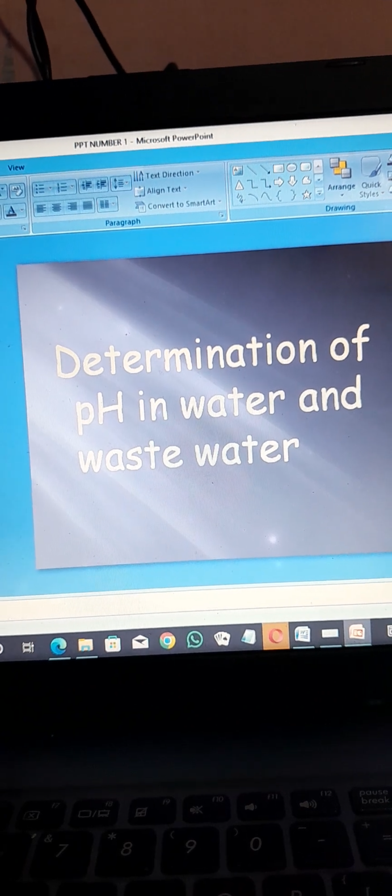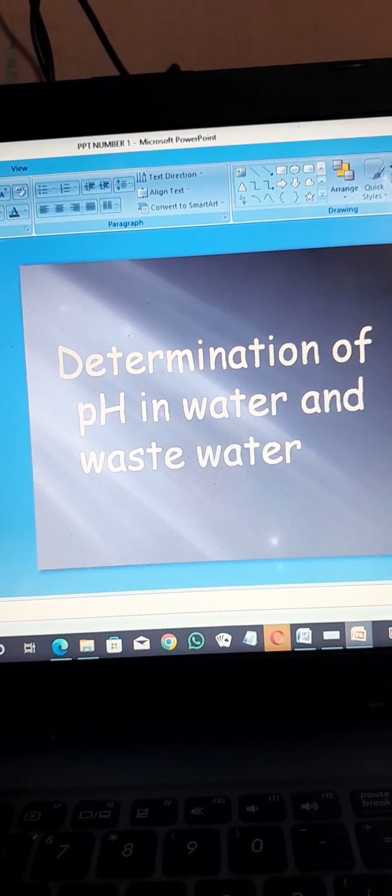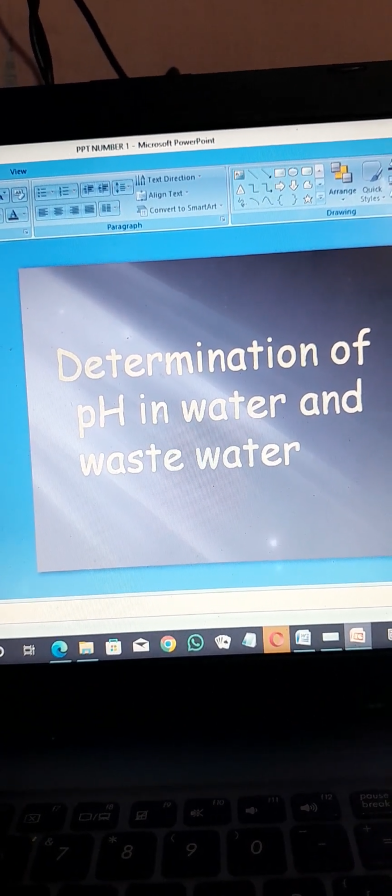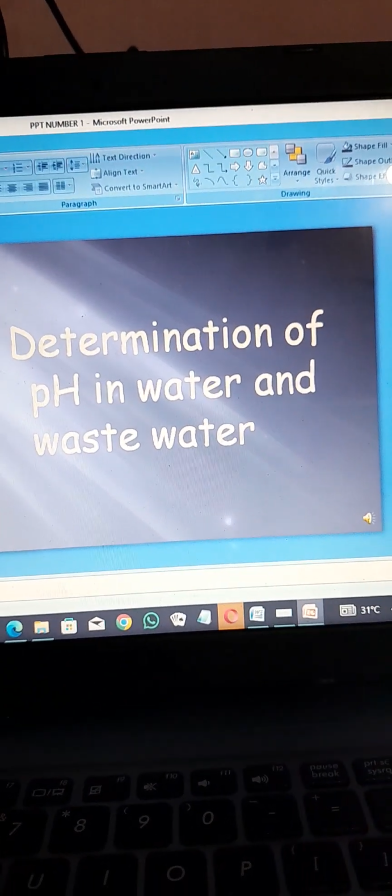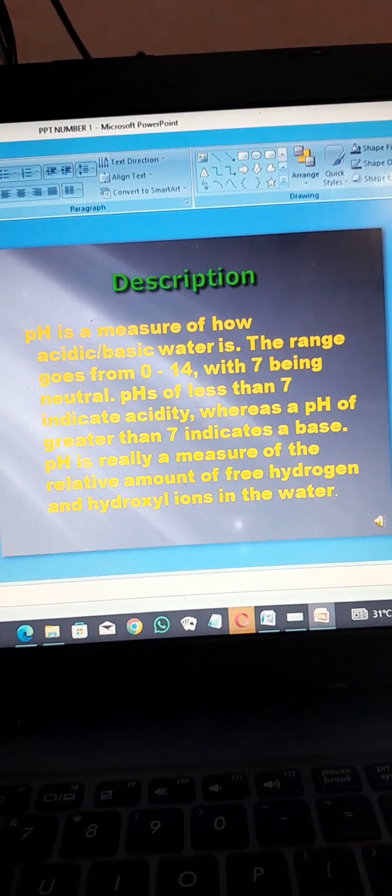Today's topic is determination of pH in water and wastewater. So without delay, let's start. Determination of pH in water and wastewater.